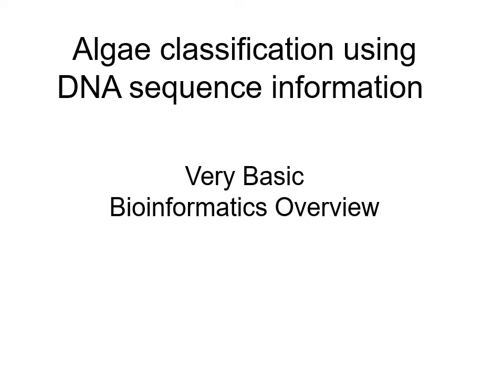All right, so this is probably going to be the last video for lab, and this is the last step of our project. Just to recap what we've done so far, first we collected genomic DNA from your unknown algae. That's all the DNA that was in the nucleus and encodes all the genes for that particular algae type. From that then, we used specific primers to target the sequence that's specific for the 18S ribosomal RNA gene.